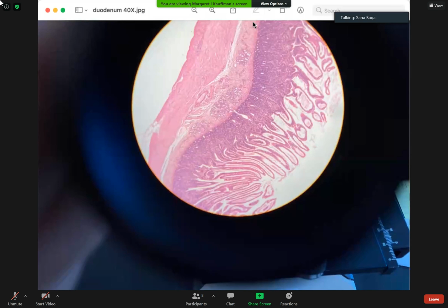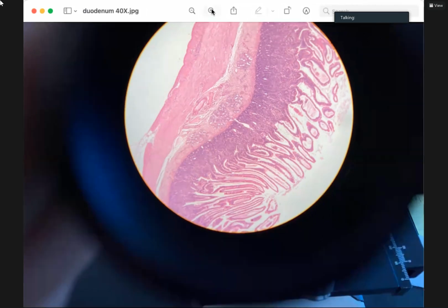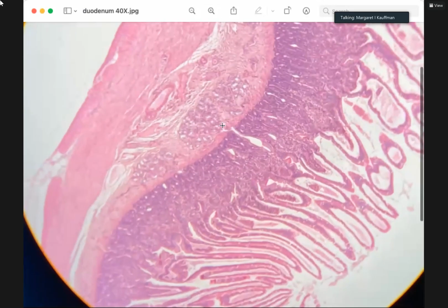Can we take a look at, I don't know if you guys already did this, the slide of the duodenum? No, they didn't do it. Okay. I just want to make sure I have high or low power. I guess we can start with the low power. I want to make sure I can see the difference between the intestinal glands versus the duodenal glands. Oh, the crypts? Duodenal crypts versus glands? Right, yeah. Okay, let me see if I can make it bigger. I know it's getting blurrier as I'm blowing it up, but at least there's some way.